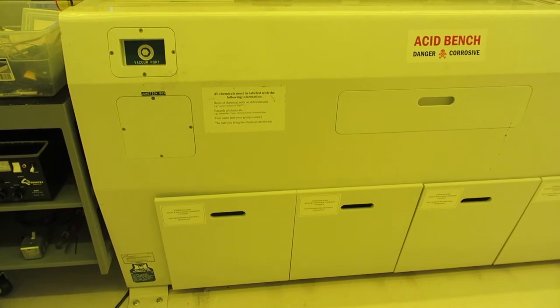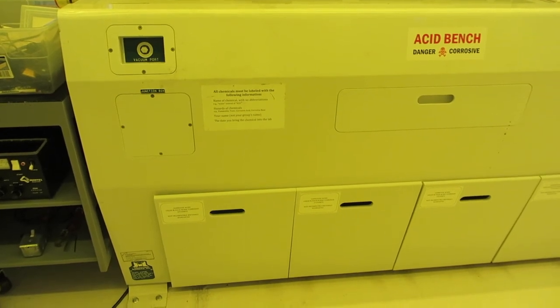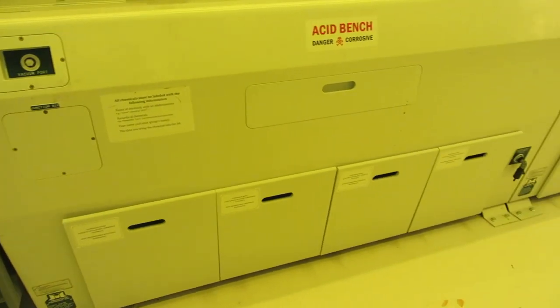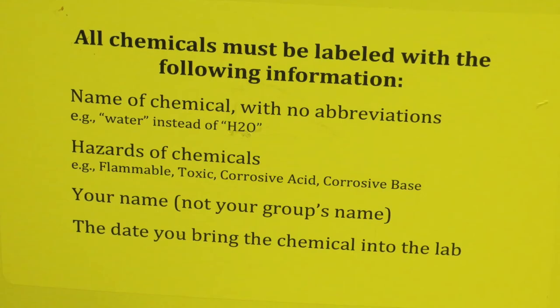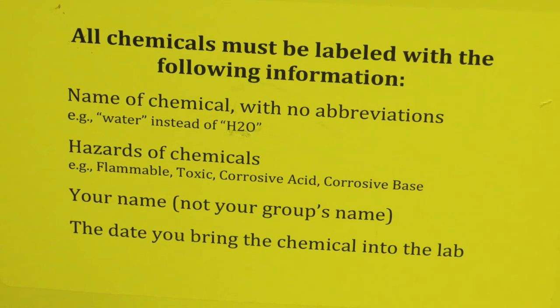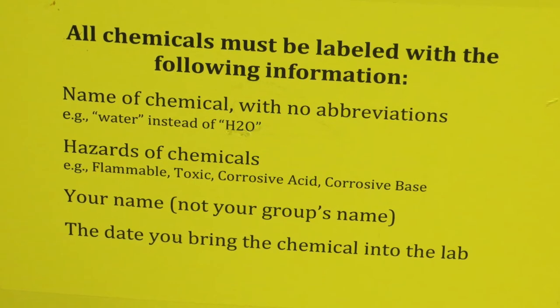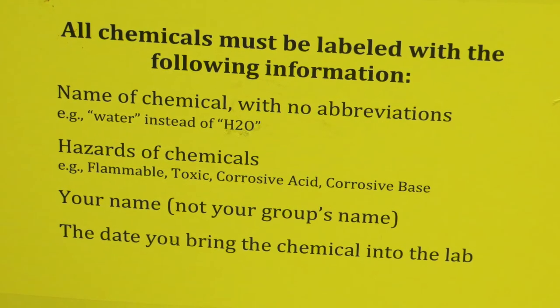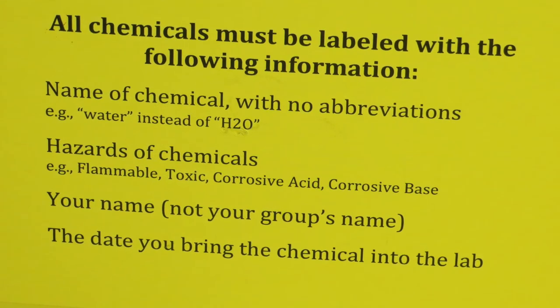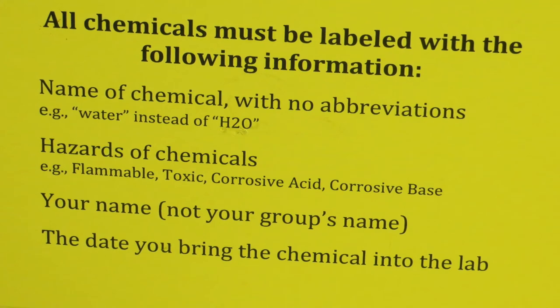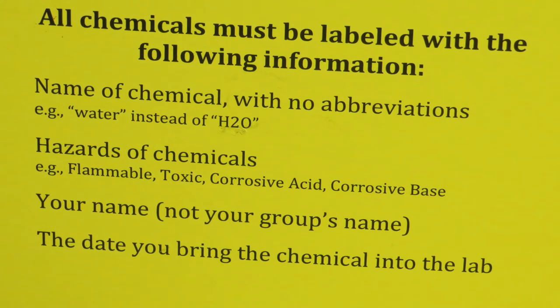If you have any of your own chemicals that you want to store in the lab, you should talk to the lab supervisor about it before you even order them, just to make sure they're acceptable for use in this lab. All chemicals must be labeled with the following information: the name of the chemical with no abbreviations, the hazards of the chemicals, your name and please don't use your group's name, and the date that you brought the chemical into the lab.